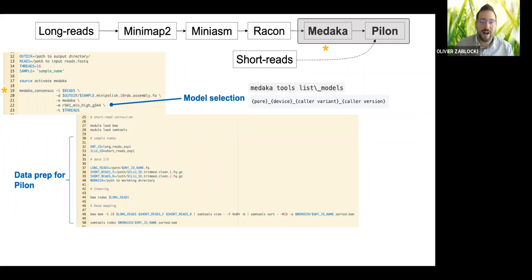Anyway, so it's a BAM file. You filtered your BAM file. You sorted by order of alignments, and you output it here. I've named it .sorted.bam. And then you would index the file in preparation. This basically indexes the file for quicker downstream access.